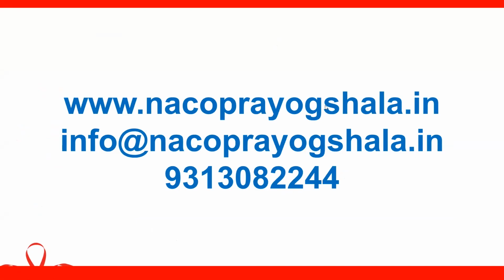The login name means the portal address, this is the email address for technical assistance, and this is the mobile number for any emergency contacts. One thing you have to be clear about: this technical assistance team can only assist with issues related to the NACO-Prayogshala, not with HR issues, not with supplies, not with the kits. Those things you have to contact NACO or the SACS directly.